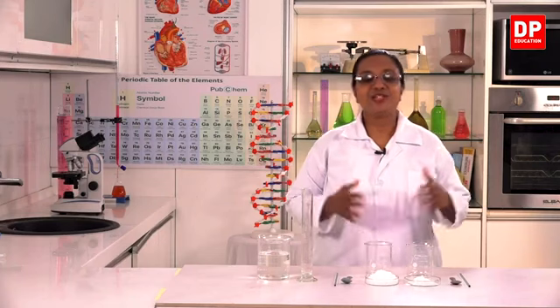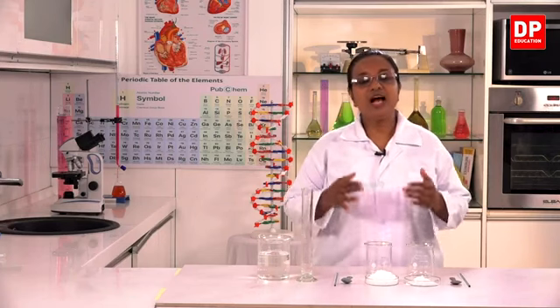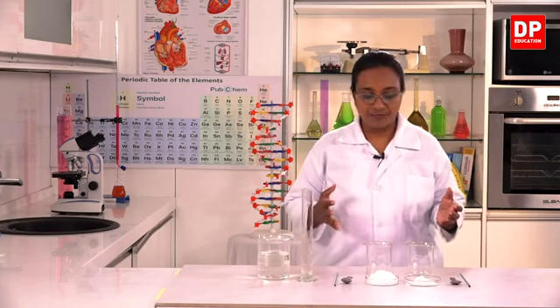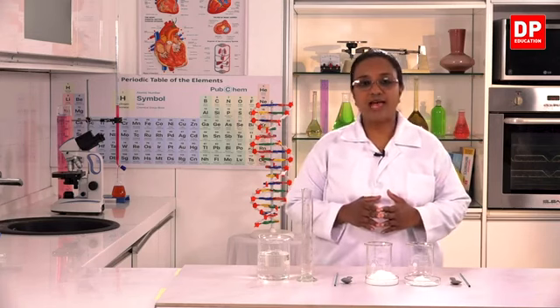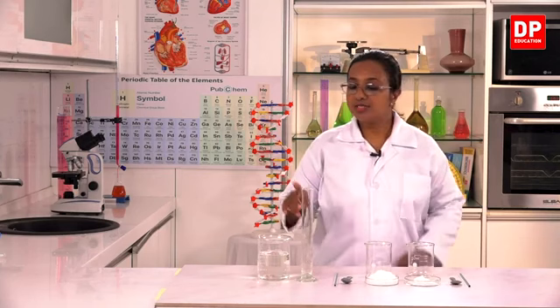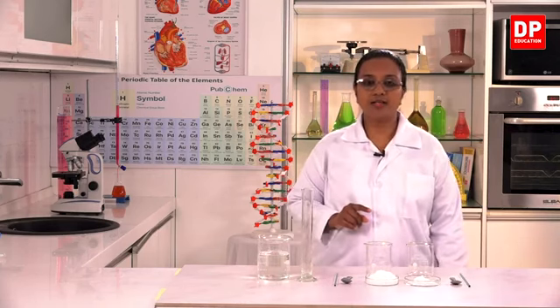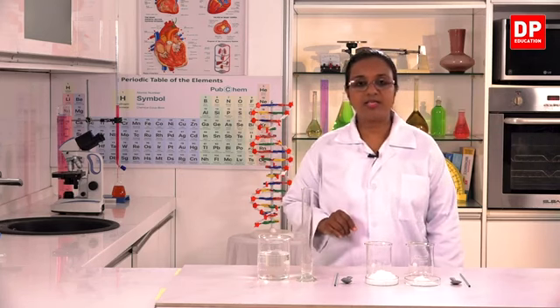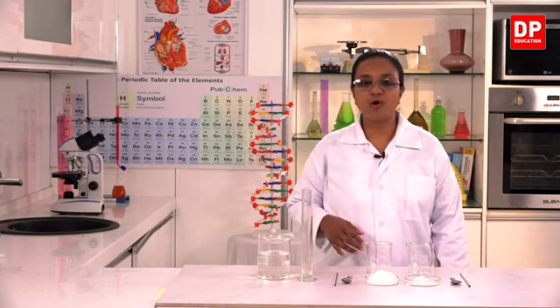Okay, students. So, now we are going to see how the solubility of different solutes vary. To observe that, we have to do two activities where we use the same solvent, that is water, and the same volume of the solvent, 100 centimeter cubes or 100 milliliters of water.